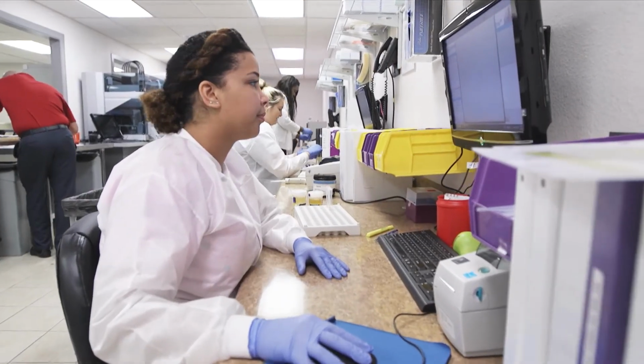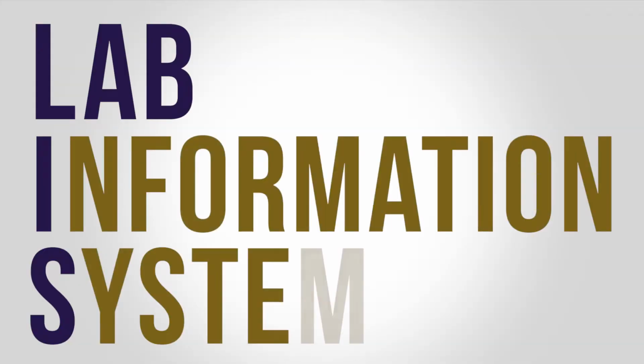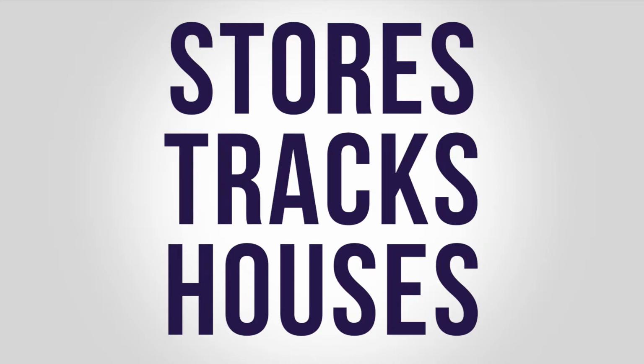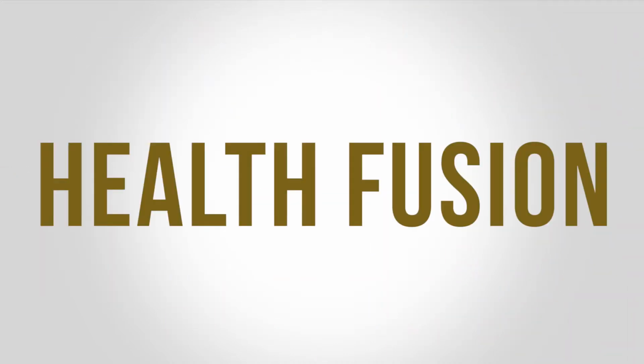Now they log all of this into the system, the LIS. It stands for Lab Information System. The LIS is what stores, tracks, and houses the specimen and the testing. The LIS that they use in the lab is called LabGen. Here in billing, however, we use a system called Health Fusion. We will get to know all about this system later on in the training.